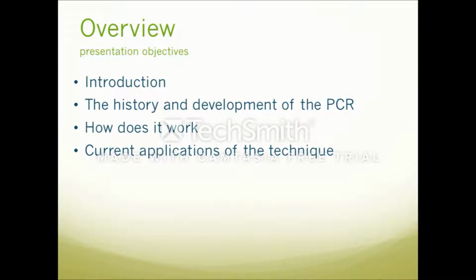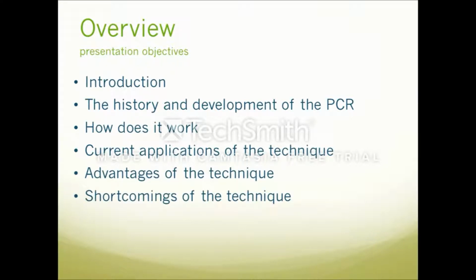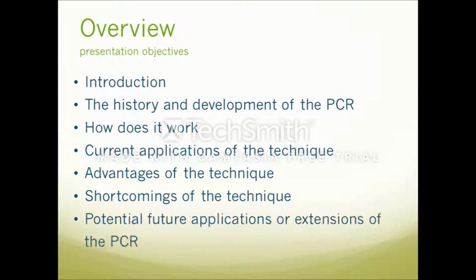We're going to see some examples of how PCR is applied in science, and the advantages of the technique, the shortcomings of the technique, and the last aspect, but not the least, covering this presentation is the potential future applications or extensions for the PCR.